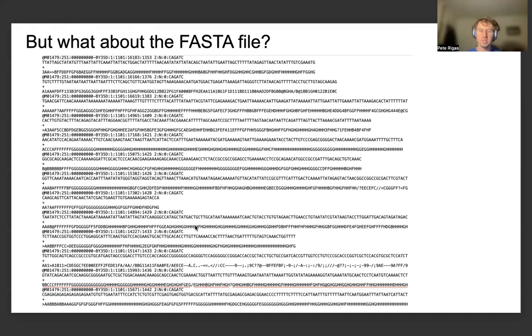So what the algorithm has to do, as we're going to highlight and describe in previous slides from the script in the GitHub repository, is look at a fixed k-mer length and at overlapping reads of the genome, and try to construct and help us visualize and more clearly understand the structure of the whole genome from shorter reads, overlapping hundreds or thousands or hundreds of thousands of these shorter reads to obtain a clearer resolution and a more complete sequencing of the entire genome from these fragmented segments.